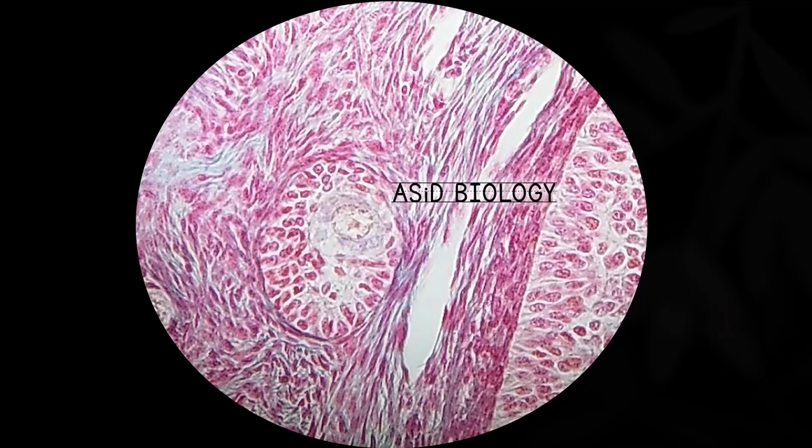The ovary has certain structures that are able to secrete hormones. This is a primary follicle. The primary follicle has follicular tissue, and follicular tissue is able to secrete hormones in the ovary.